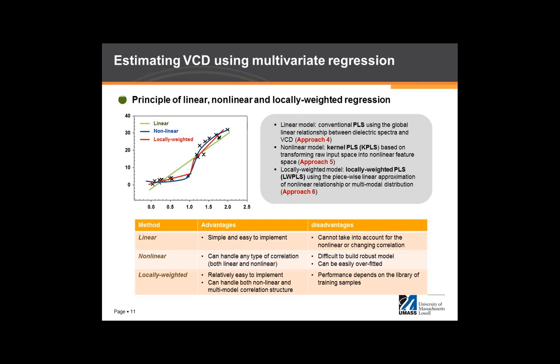It's multivariate statistics, and many of you might be familiar with it. Here I want to give you a little explanation of what it is. Usually principal component analysis and partial least squares are linear system-based techniques. Partial least squares works very well in giving a regression model between input and output data for a linear system. In this case, the input data is the dielectric spectrum, and the output data is the offline viable cell density. So we are finding a regression model.